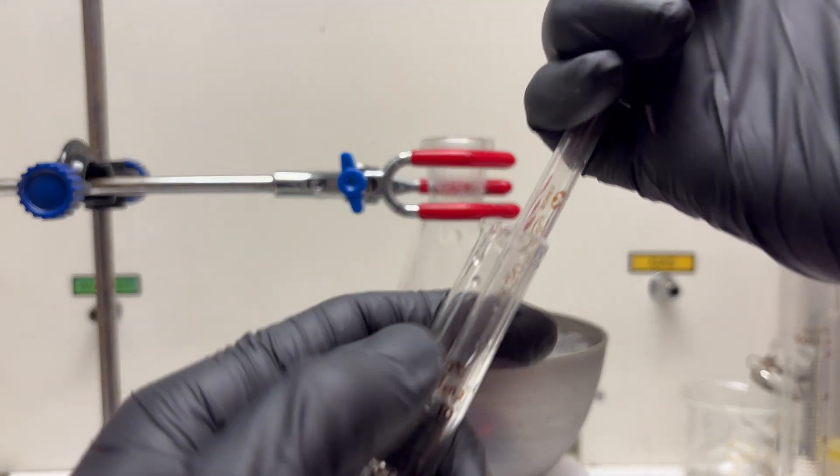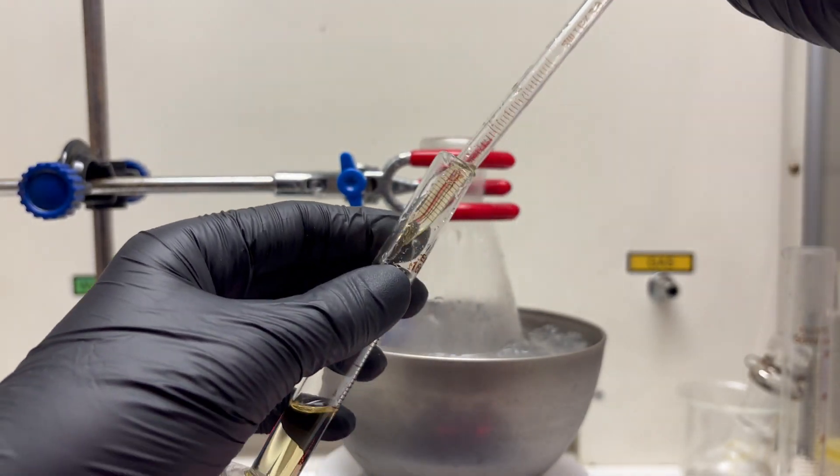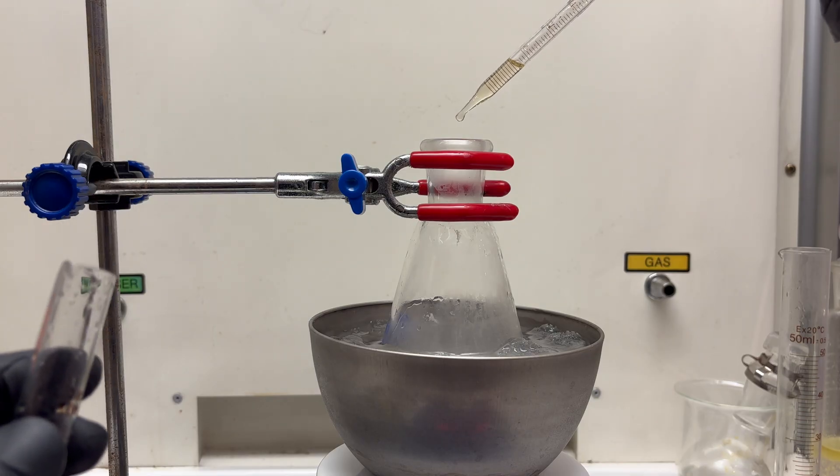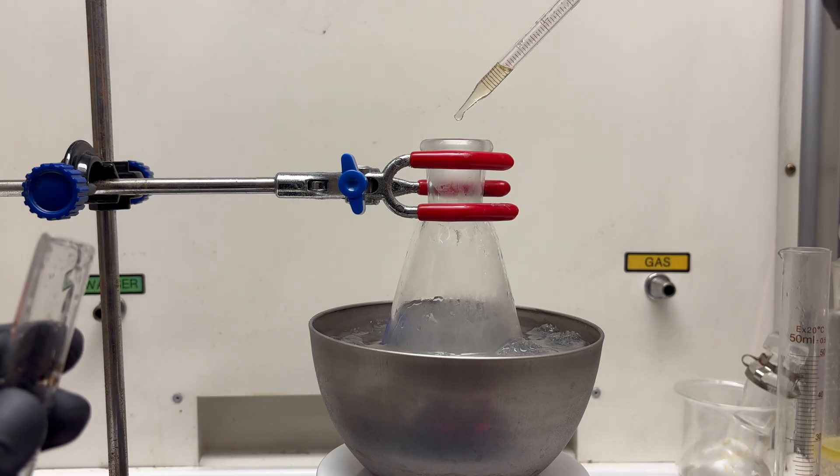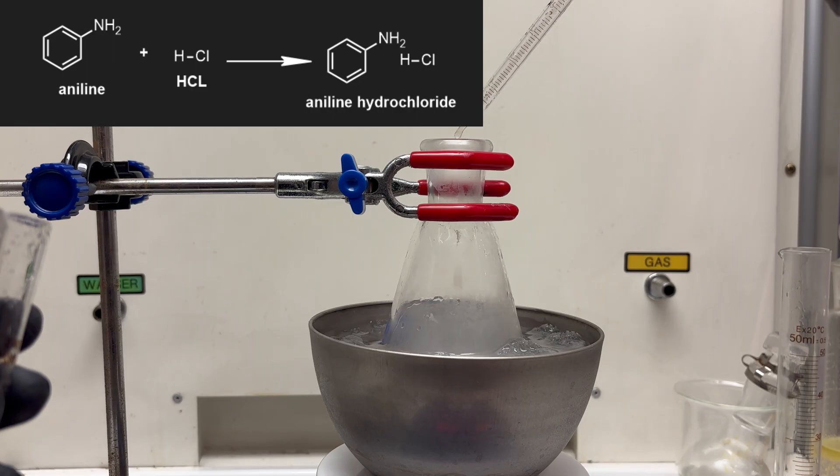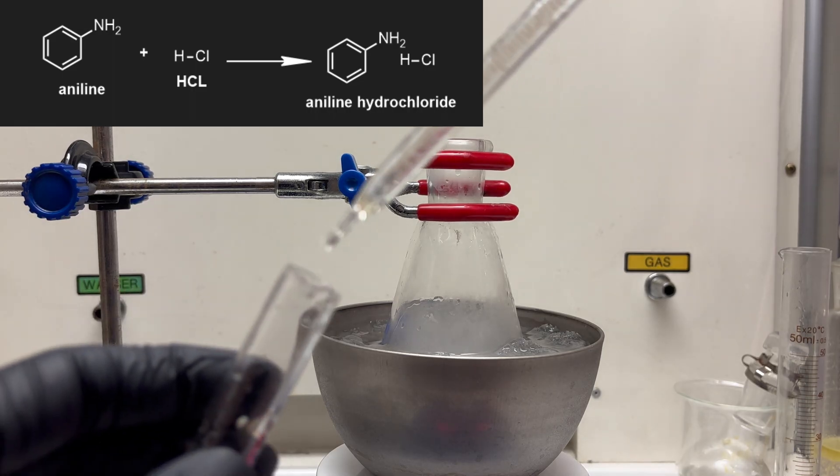Then 4.3 milliliters of aniline are added to the flask. It's important to add aniline slowly because it's producing a lot of heat. When the aniline is added, it reacts with the hydrochloric acid to form aniline hydrochloride.